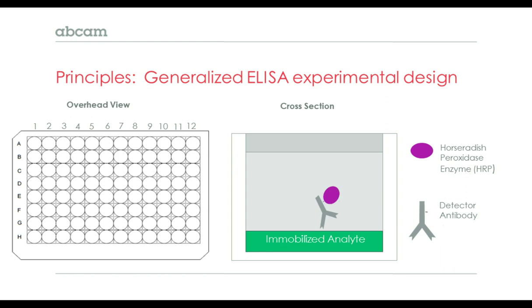assay. Using a multi-well format allows for numerous samples to be analyzed simultaneously and compared within the same assay. In many ELISA kits, the plates can also be separated into individual columns so that the entire plate doesn't need to be used up in a single run. This allows a researcher to come back and run additional samples later once they have collected those samples.